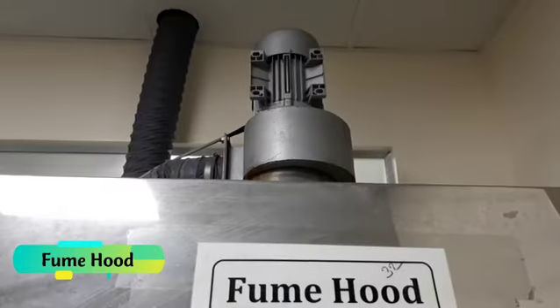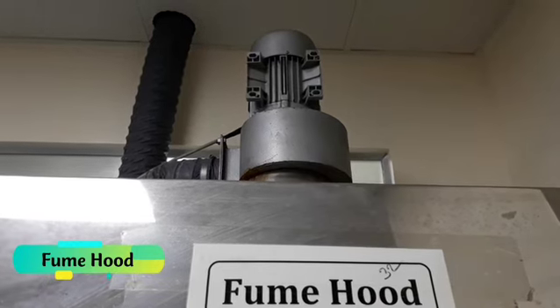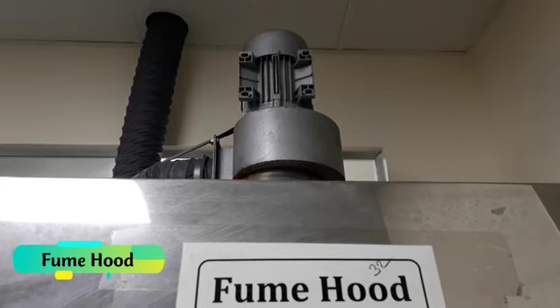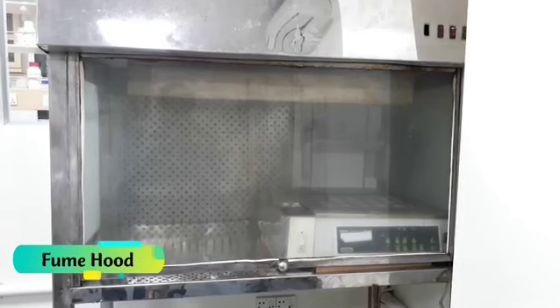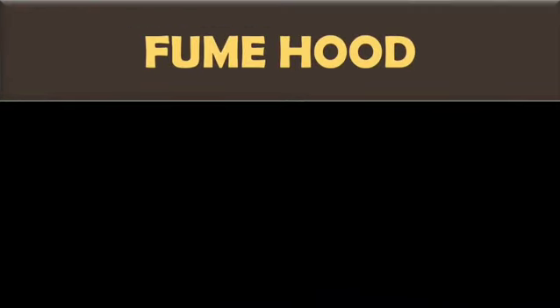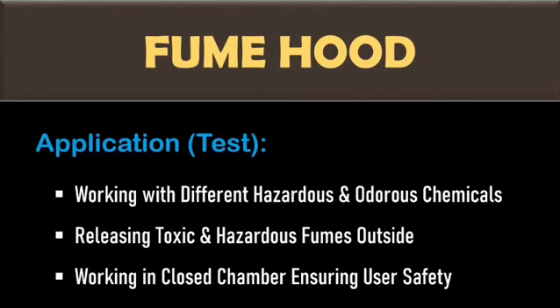A glass sash provides a barrier between the user and the chemicals. Applications: handling toxic, flammable, or corrosive substances, and protecting lab personnel from chemical inhalation and splashes.